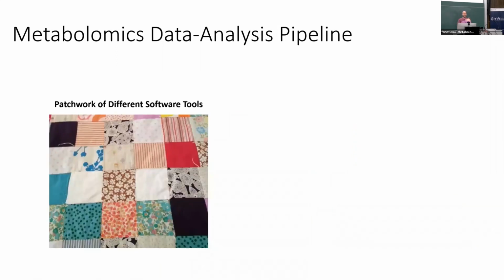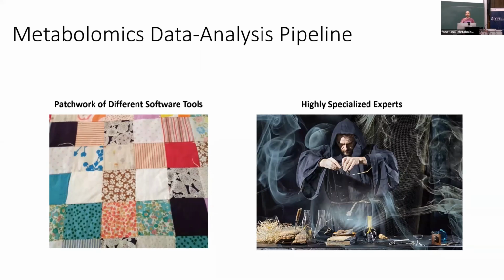So in that framework, and hopefully that's also the conclusion for this week, we have a patchwork of different software tools that we put together either in a semi-continuous way by going step by step, or in pipelines such as Axel and Ilfi presented. And then hopefully after this week, or after years and years of training, we become highly specialized experts, and we'll master whatever data analysis we have to do.